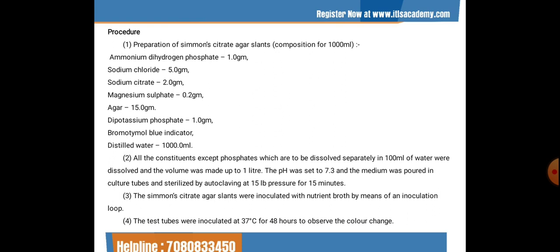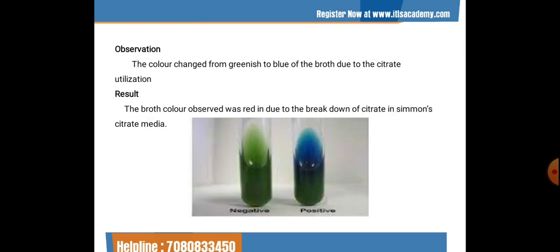The Simmons citrate agar slants were inoculated with nutrient broth using an inoculation loop and incubated at 37°C for 48 hours to observe color change. The color changed from green to blue due to citrate utilization. The green color indicates a negative test, while a blue color indicates a positive test for citrate utilization by the bacteria in the media.